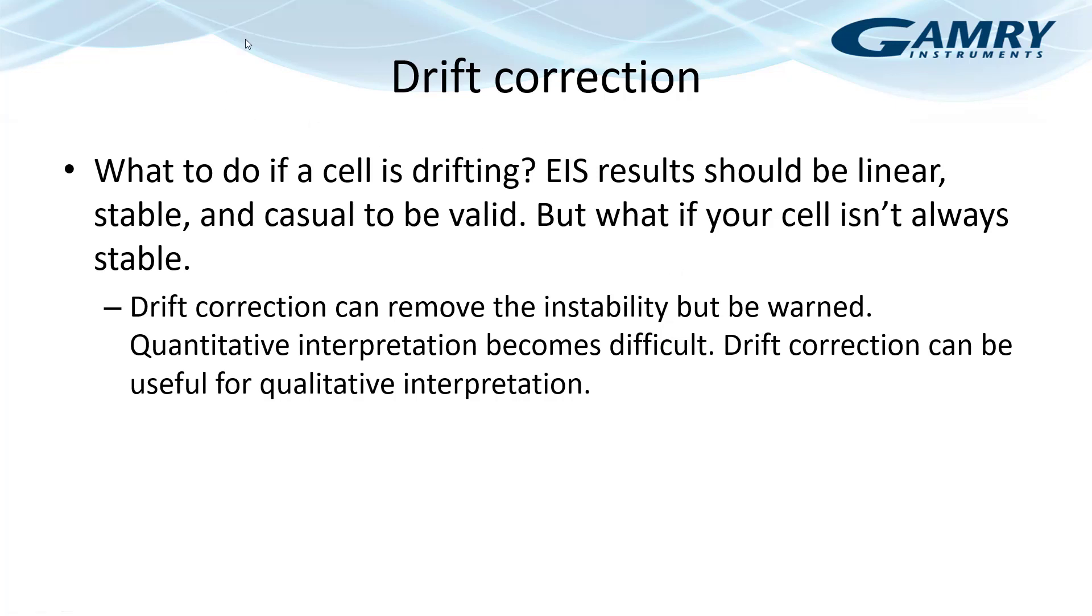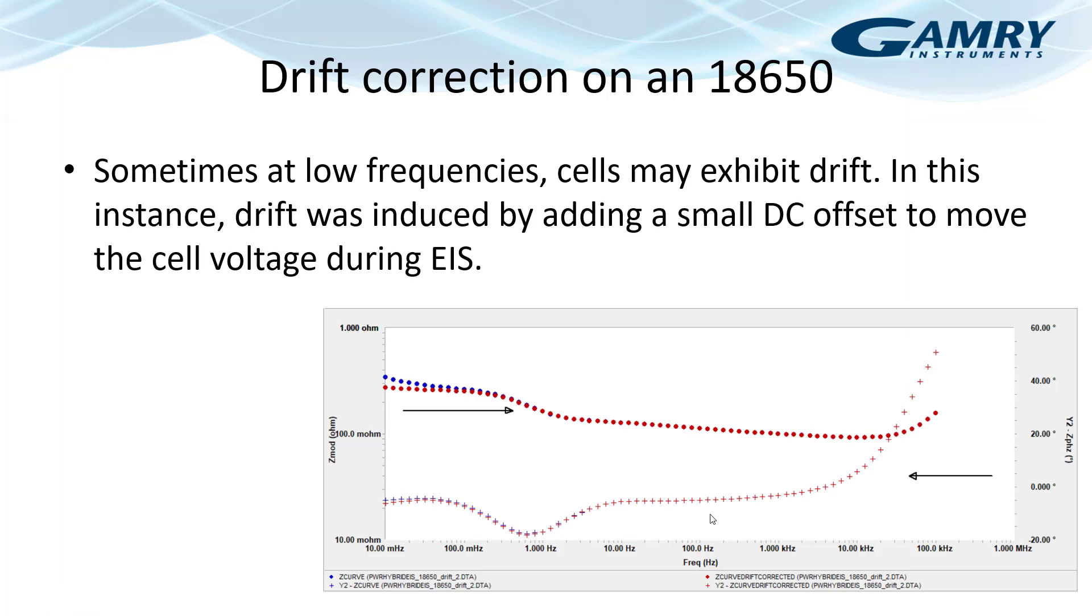So let's move on to drift correction to try to speed things up. There's lots of times that you might run into a cell where as you go to lower and lower frequencies, that cell voltage is drifting. In order for EIS results to be valid, they need to be linear, stable and causal. And if your cell is drifting, then you have a problem. So drift correction can be used to remove this instability. But we want to warn you that once you apply this drift correction, quantitative interpretation becomes rather difficult. And personally, we would recommend drift correction is used for qualitative data interpretation. Otherwise, people would question the validity of your data. But again, as you saw, it can be applied.